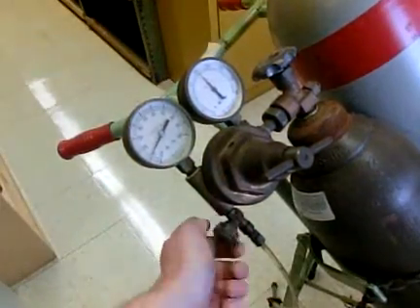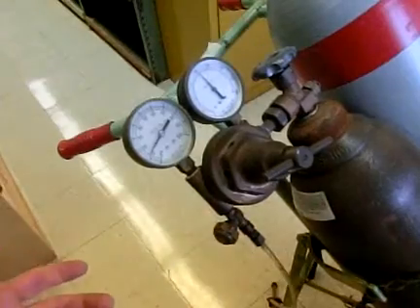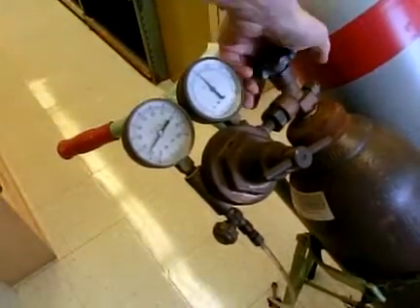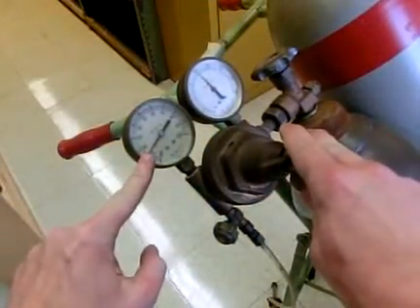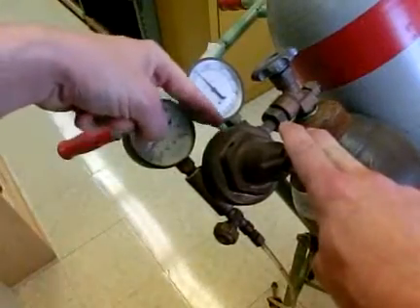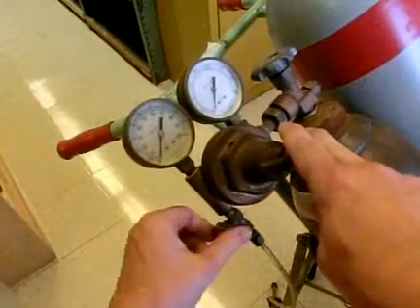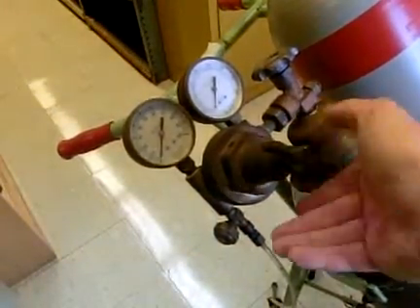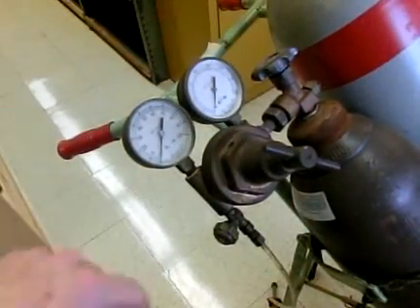Once you fill up your balloon or whatever it happens to be, lock that off — you're done. To turn everything off: first, turn off the tank. Second, make sure this is open enough to bleed the valve, because right now there's still too much pressure inside this portion. Open this all the way up, drain it, close it, then reopen this so that gas won't automatically come out when it's open.